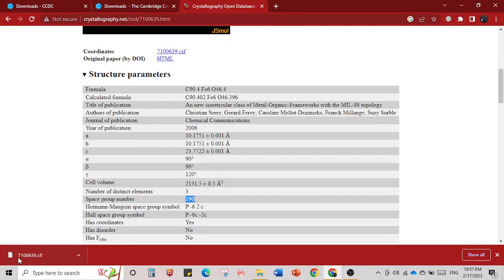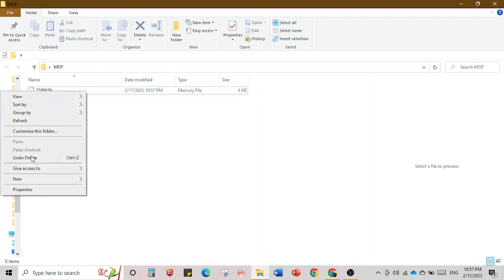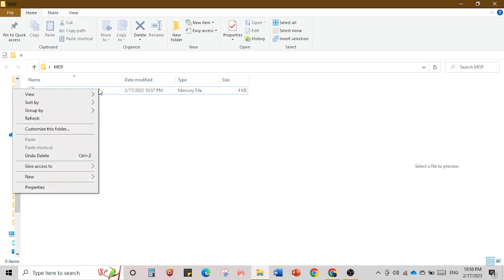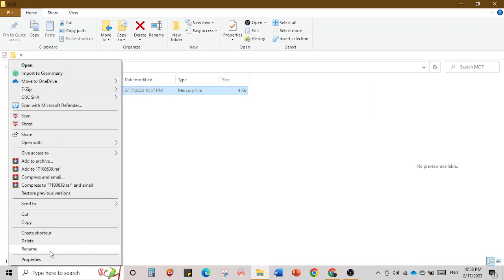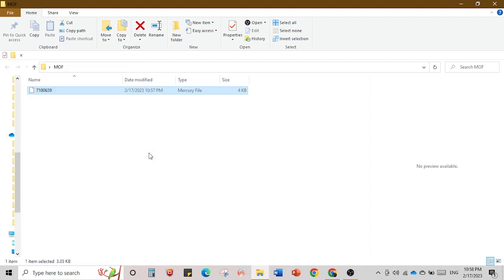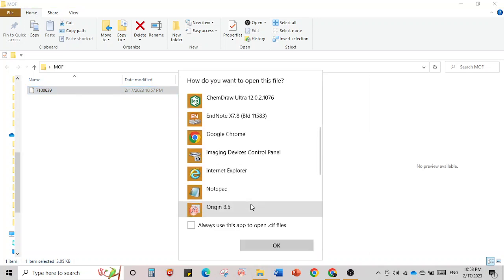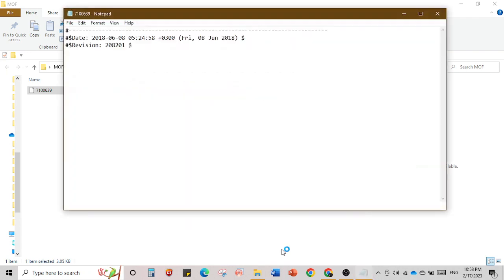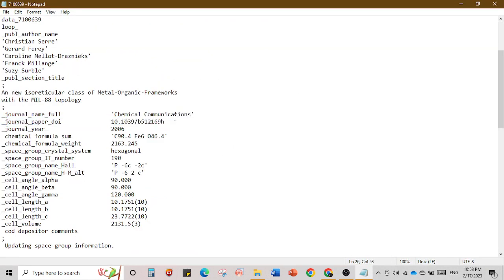The downloaded file is called 7100693. When you open it as a text file you can see all the information — it was published in Chemical Communications, the DOI number, 2009, the formula, and all the coordinates of the crystal structure. If you are doing computational chemistry or theoretical studies, these coordinates are very important. Now we can close it and open it with Mercury.